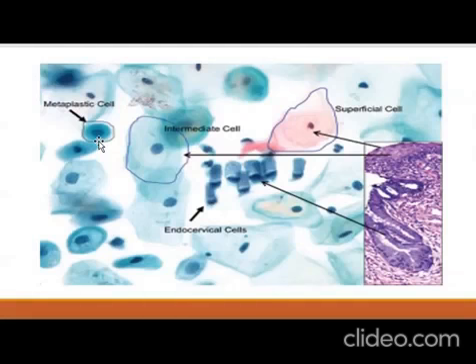Same with how we diagnose parasitic infections. Diba? We do not only focus on one feature. We also consider other features as well. So, same with your Pap stain now. When you try to read your Pap smear, after staining, you need to consider not only one feature like the color, but you also need to consider other features as well. And I hope you're going to discuss that one in the lecture.